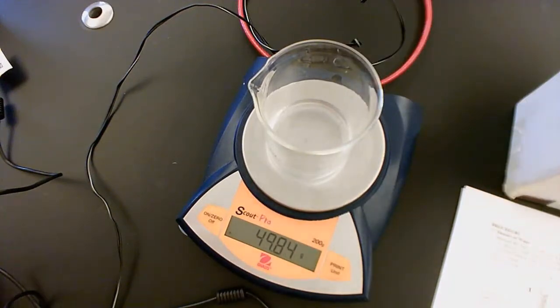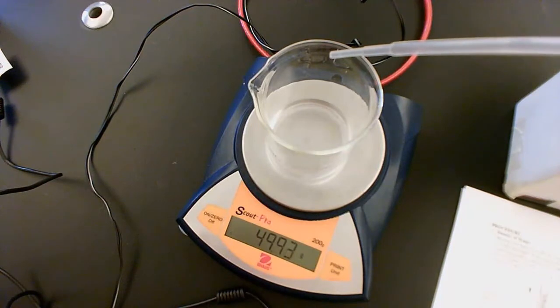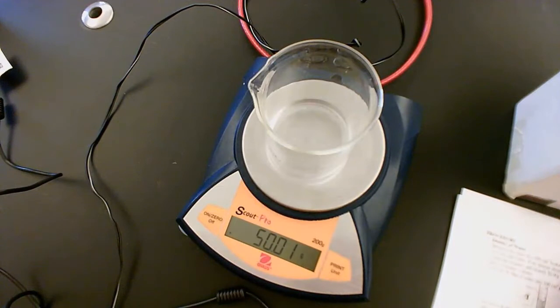So close. So now this is called a disposable pipette. I am going to add some drops of water because I'm very close. All right. It's close enough. It's 50.01 grams. So make sure you make a note that we added 50.01 grams.